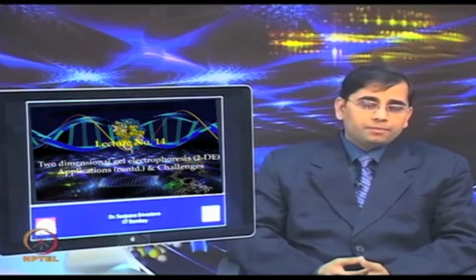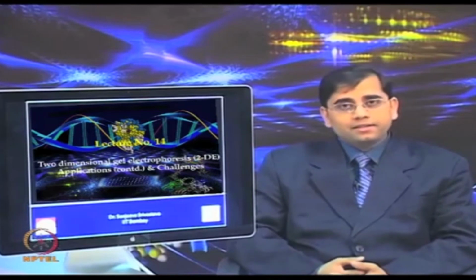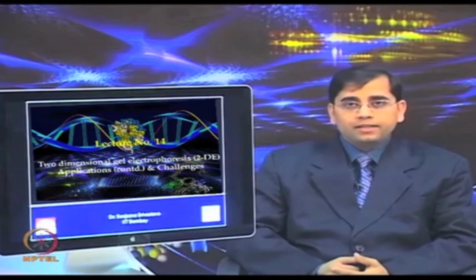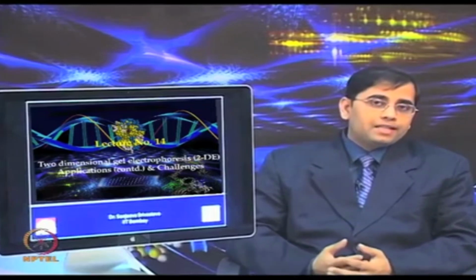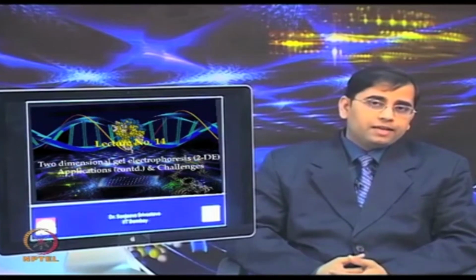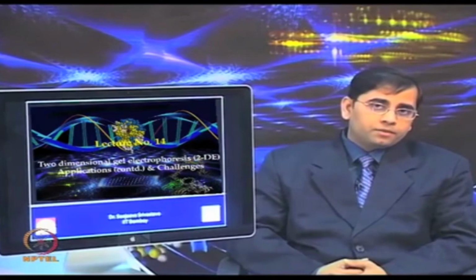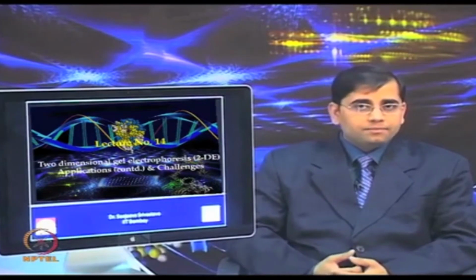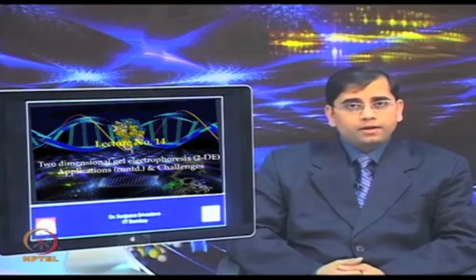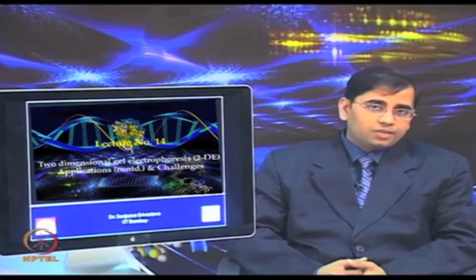We have gone through step by step, starting from the protein extraction, doing the quantification, isoelectric focusing, which separates proteins in their first dimension, followed by equilibration, preparing the strips for second dimension separation, and then you separate the proteins on the SDS-PAGE based on the molecular weight, followed by staining the gels to visualize the spots, and then scan those images, analyze them using various software, and then perform some statistical analysis to obtain some biological insight.